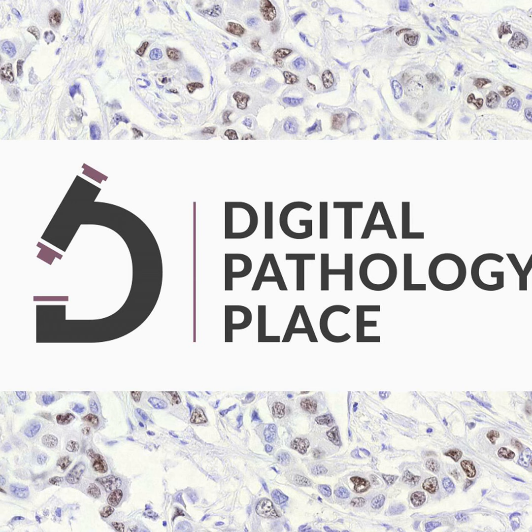And so being able to look at the image and turn on and turn off channels, even turn on and turn off biomarker channels rather than the imaging signals, can be challenging because there's so many things going on at the same time. And really what you'd like to do is look at graphs, look at plots, look at two-dimensional reduction plots and data visualizations to help you interpret what's going on, not only in the one image that you're looking at on the screen, but also all the images that you've probably multiplexed as population studies. And so I think that data visualizations are really an important tool to be able to evaluate how good the phenotyping has performed, as well as to get some really exciting results out.